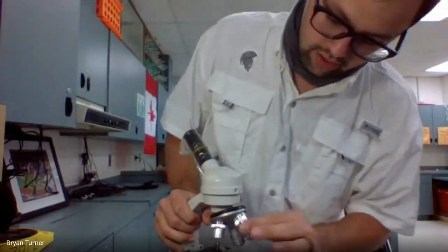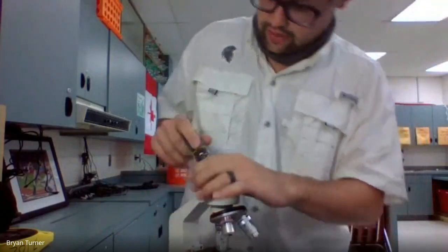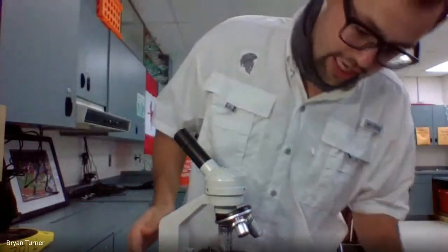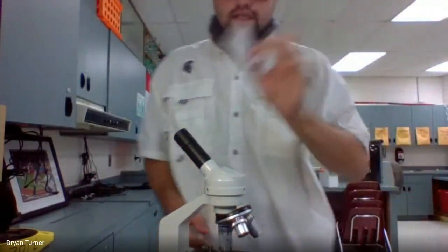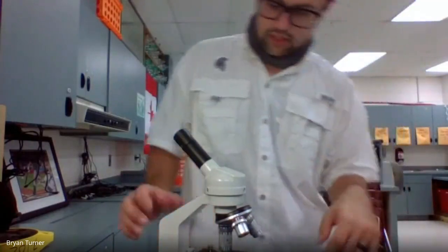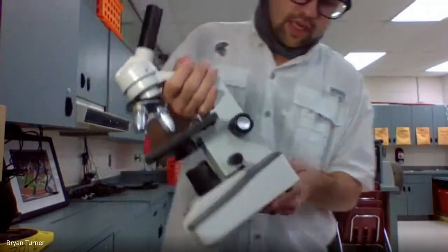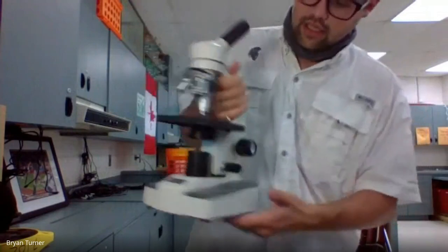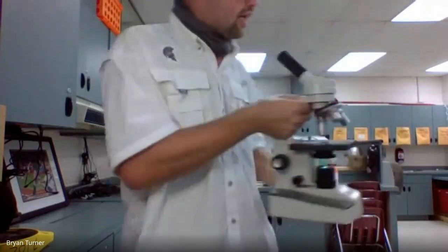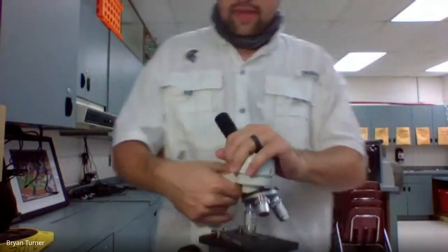Here we have our different magnifiers and our eyepiece up here. Nice arm. Stage looks beautiful. Silica gel, very important. And got our light source on the bottom. These are super cool microscopes. They're LEDs, so you can turn them on. They're wireless as well, so you can charge them, take them to station. Make sure it's super safe.